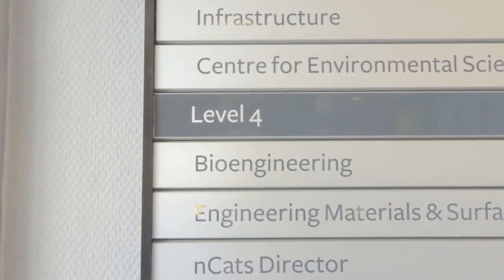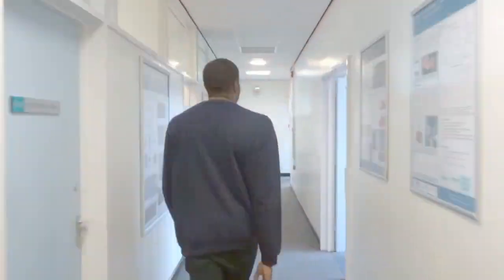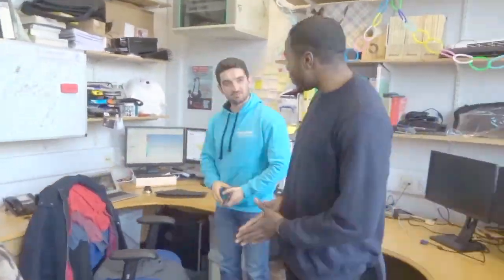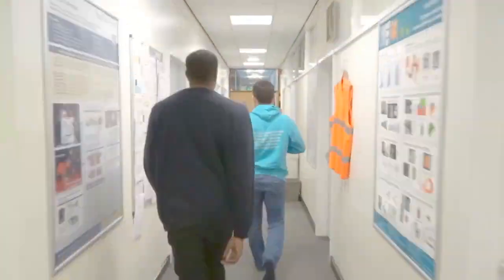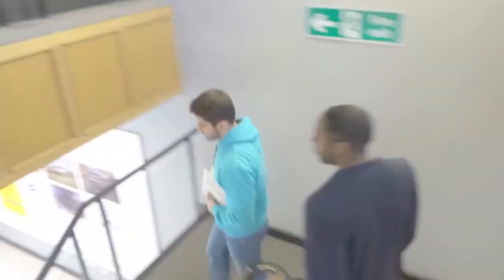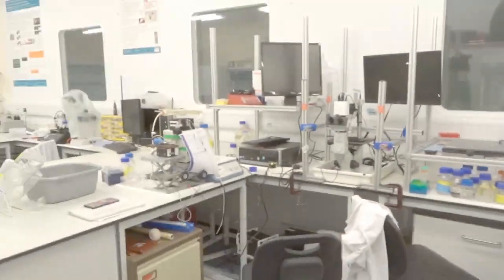This is much the same concept behind microfluidics. Rather than studying a biological phenomenon inside the body by cutting the patient open, a microfluidic chip allows us to create a replica of the environment for the biological phenomenon. This can then be studied in isolation. To find out more about microfluidics, we spoke to an expert, Ali Mosayyebi, a PhD student at Southampton University.